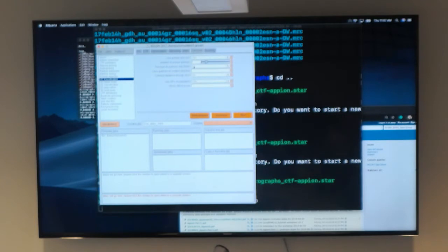And when we created a stack, it skipped hidden or rejected images. Therefore, the box files are much less than the full micrographs. That was on purpose. So if you've done micrograph curation, there are different ways of applying curation. If you just literally didn't copy that micrograph, that's easy. Or if you did copy the micrograph and you want to work on a certain subset, how do you mark that?